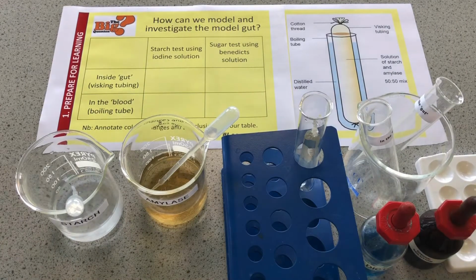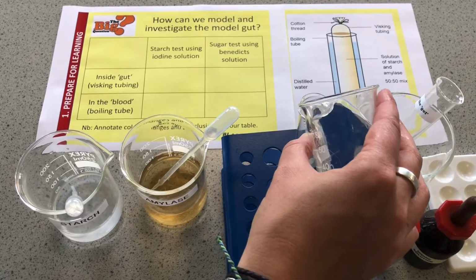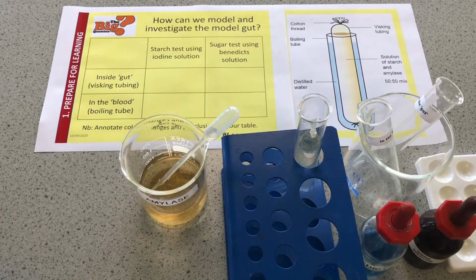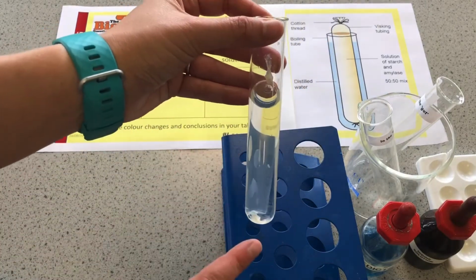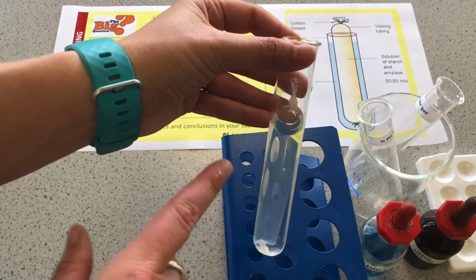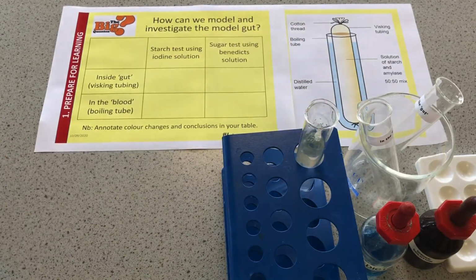And then in my rack here I've got a boiling tube there, and I'm going to add some water to the tube, which will be surrounding the Visking tubing. Now that water represents the blood. So if I show you what I've got, my tube of water representing the blood, and I've got my small intestine model inside it with the starch and the amylase. And I'm going to leave that so that the amylase has time to chop all of that starch down into those smaller units of glucose.